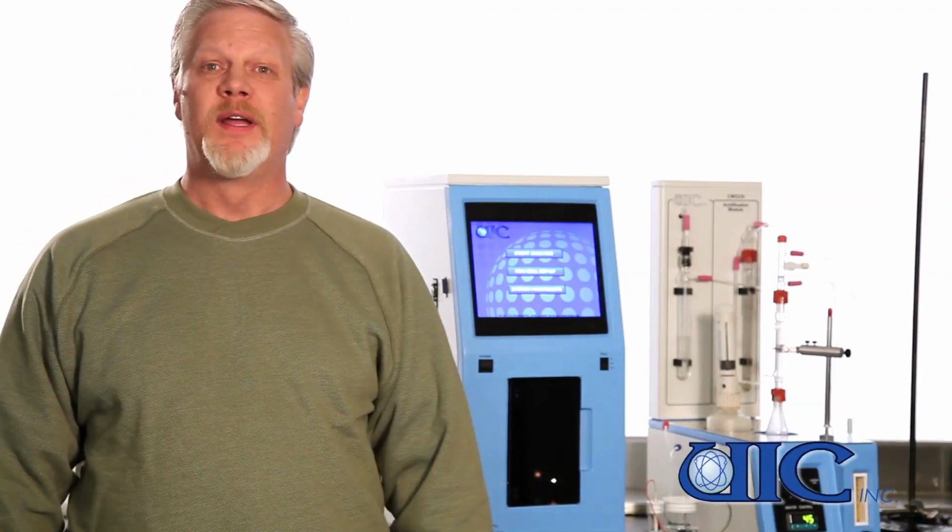We're here today to go over real quick how to run an Amine sample, and we're also going to go over the components that it takes to run that sample. UIC delivers our systems as modular components. The system will always consist of a coulometer as a detector, and then either an acidification unit or a furnace unit for producing the CO2 that the coulometer detects.